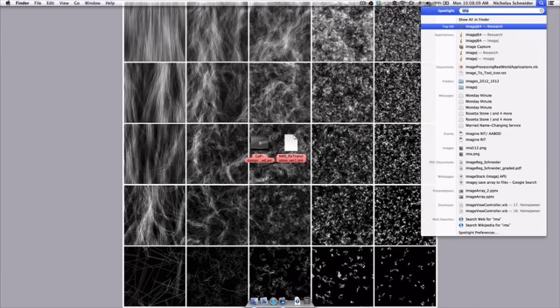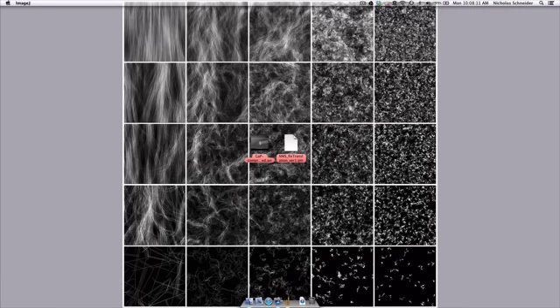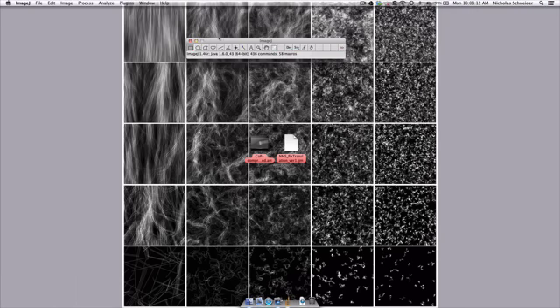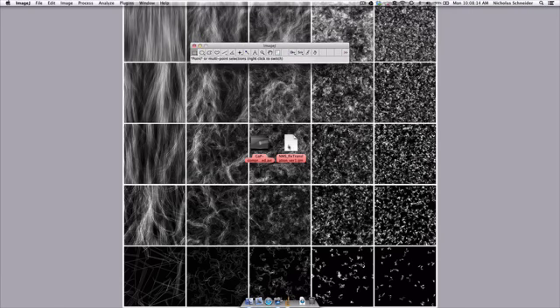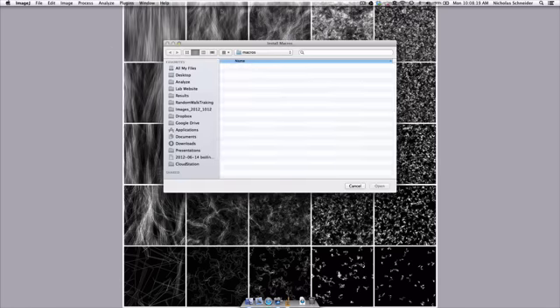So let's go ahead and open up ImageJ. The first thing we have to do is install the macro, and we can do that by going to Plugins on the File menu, Macros, Install.